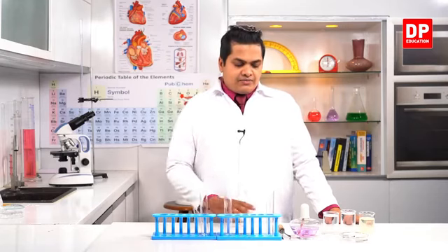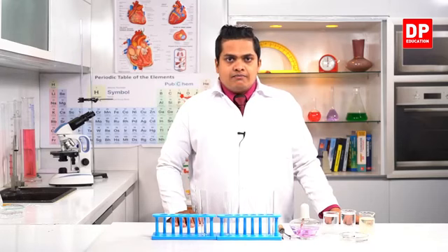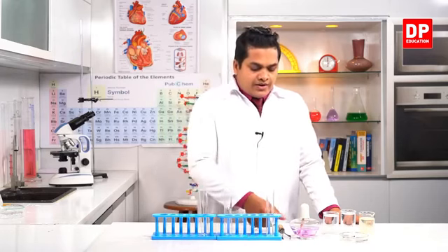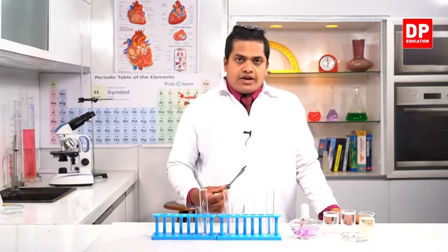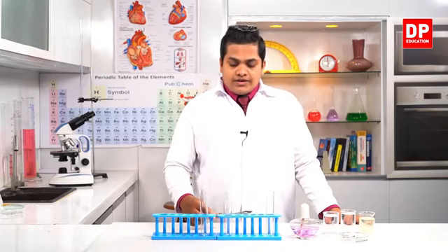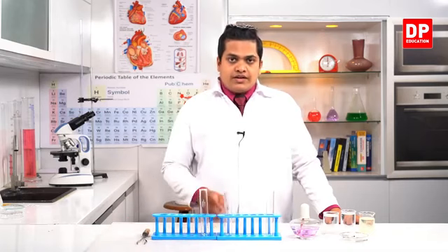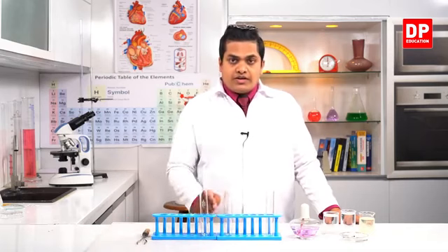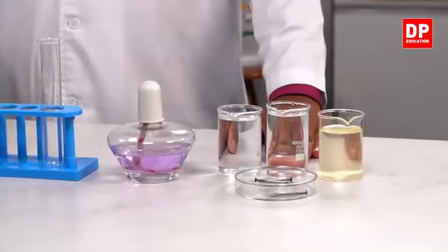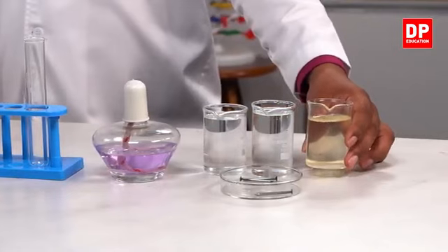So I have these materials with me, and I'm going to conduct the activity. Let's see first of all what these materials are. I have a forceps to handle the boiling tubes, right? Then several boiling tubes. Here I have 3 boiling tubes, 1, 2 and 3. Some water. Then this is coconut oil, right? Coconut oil.